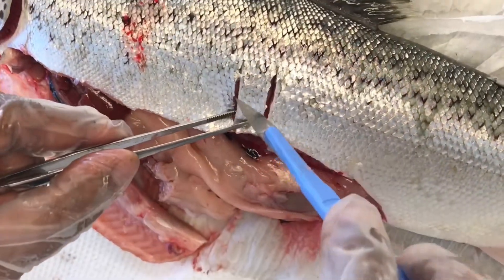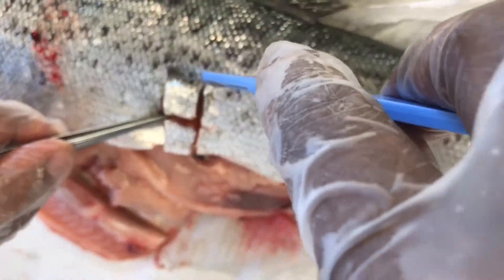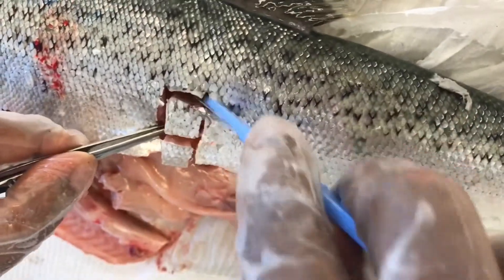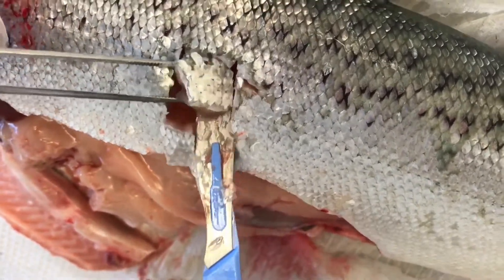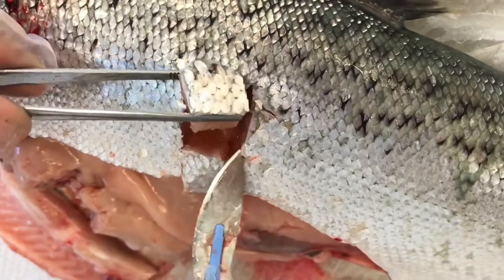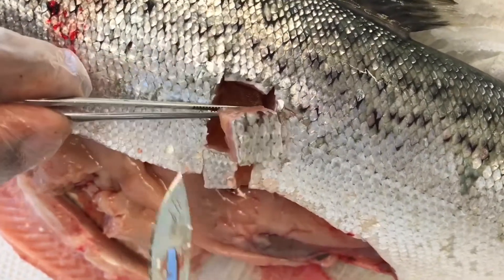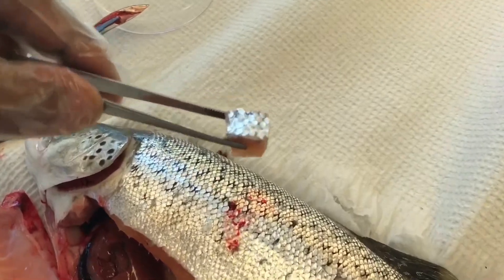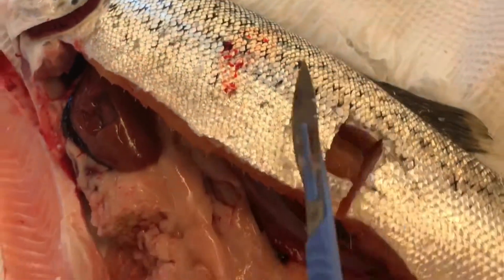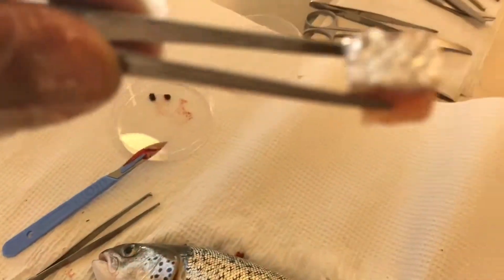This is the lateral line. Dissect out a good portion of skin and muscle. The thickness should not exceed 4 mm for the fixative to penetrate the tissue. The lateral line serves as a good reference to include both white and red muscle — in salmon, for example.